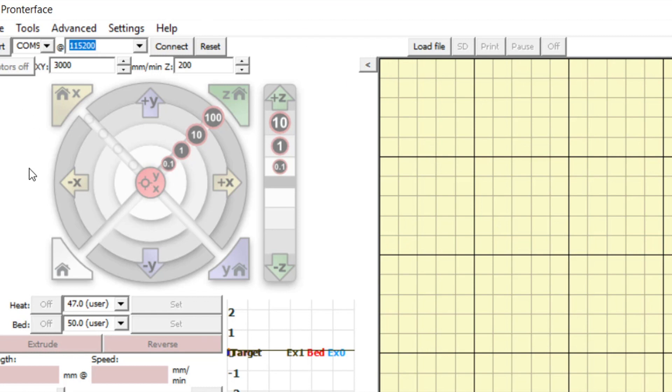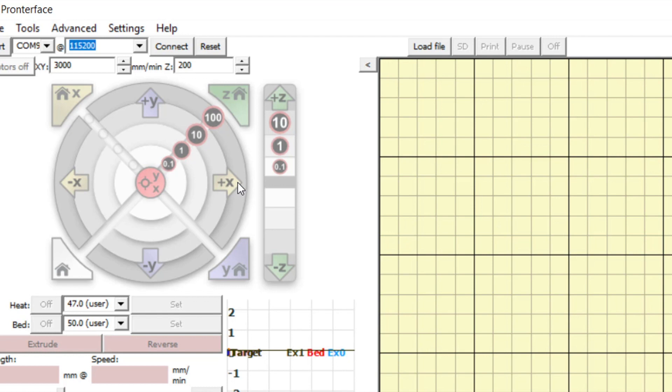Below is the control panel where you can manually move the bioprinter components. You can move the extruder head in the X direction using the buttons for 0.1, 1, 10 or 100 mm in the positive and negative X directions.